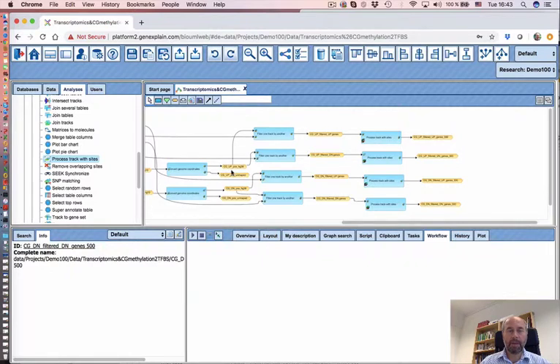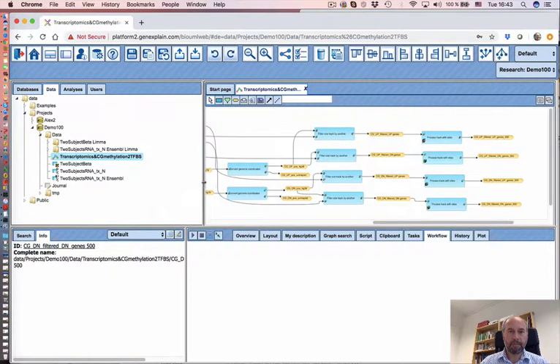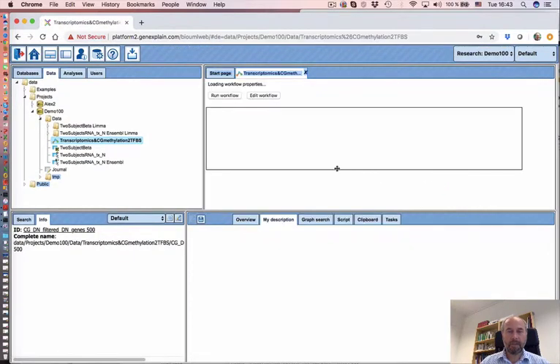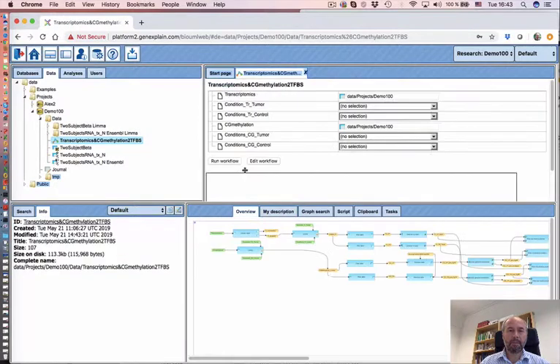It will prepare it for the run, and then we select our data. Let's wait until it's ready. Okay, it's initiated 2 times, so we can close 1. Now it's building this workflow. Now it's ready to start.